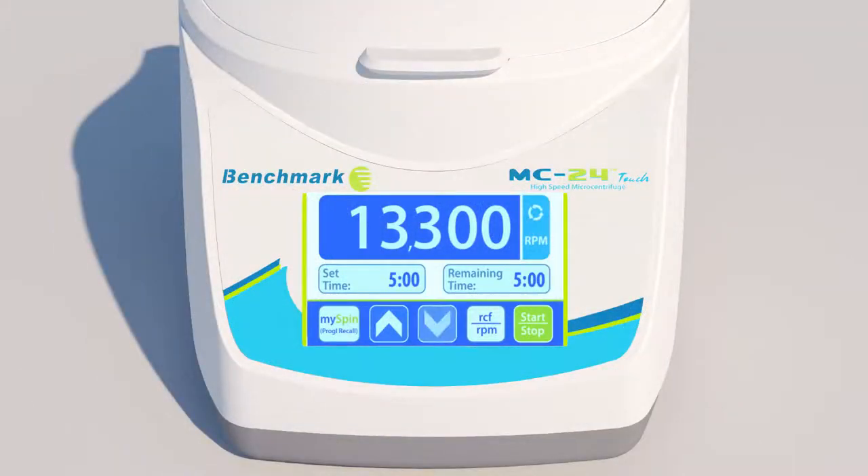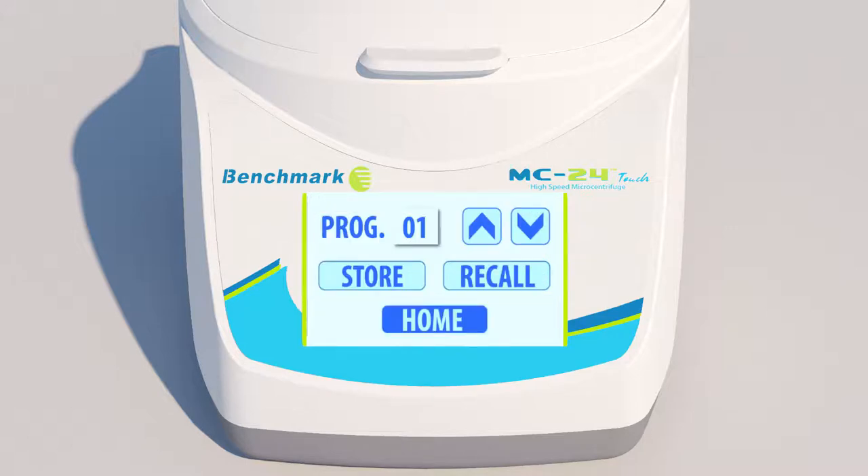Recalling your favorite settings is as easy as pressing the MySpin Program Recall button. To use the MySpin Program Recall, enter your favorite settings, then hold the MySpin button for 3 seconds. When the Program Storage menu appears, press the Store button to store your settings in the first slot, then press Home to exit.